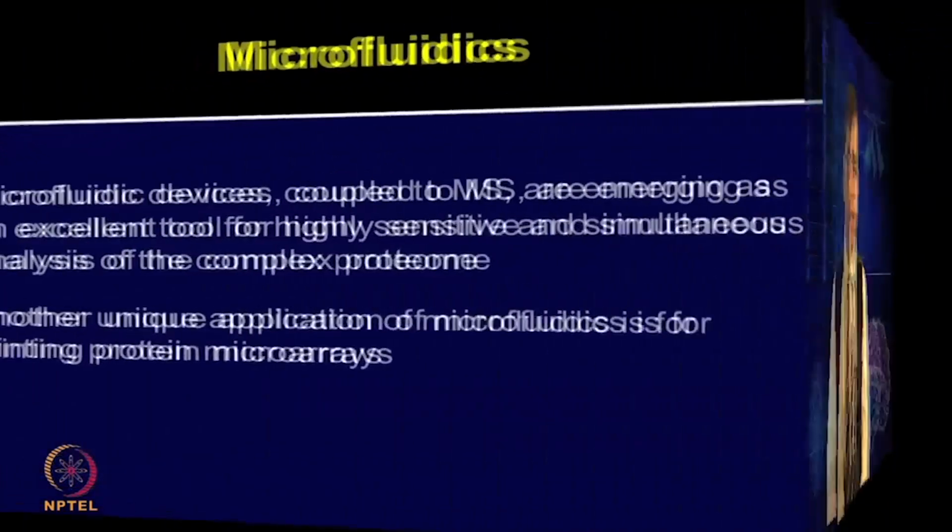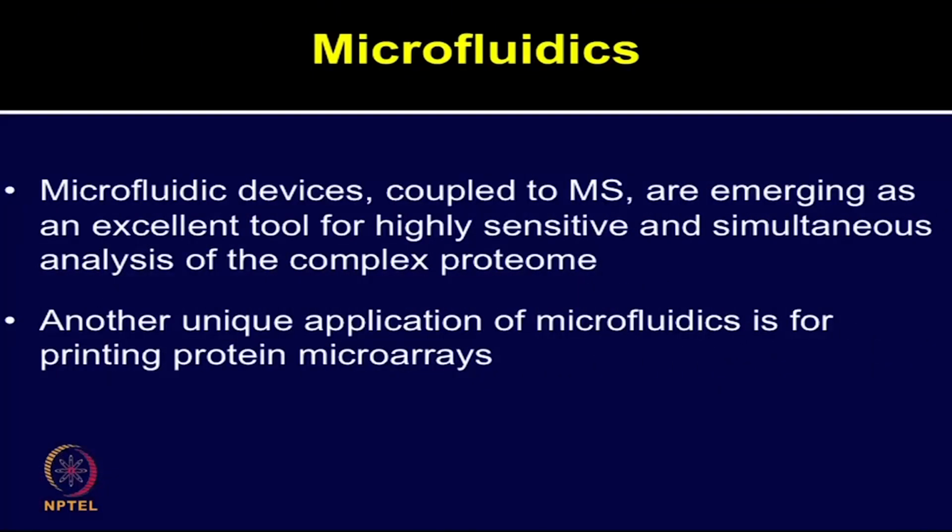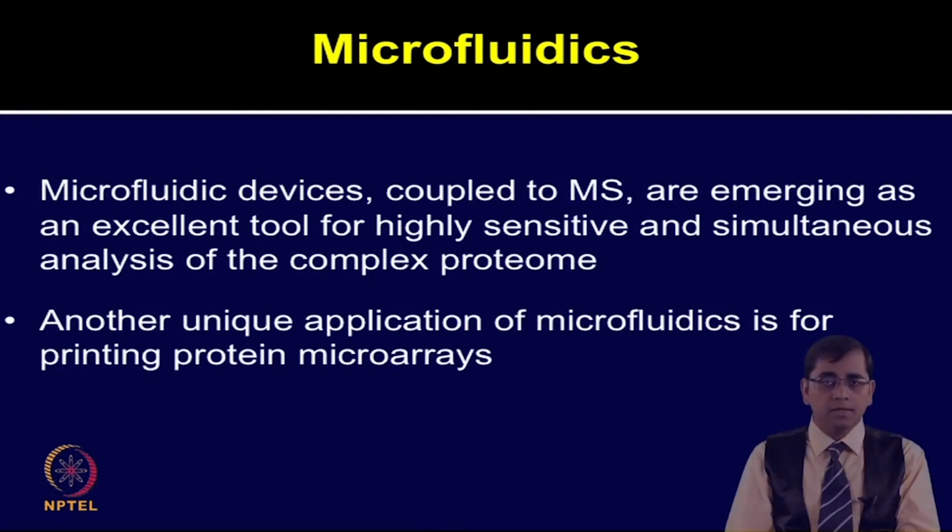Microfluidic devices are now increasingly applied in proteomics and coupled with different types of proteomic technologies. There is intense research and increasing interest in using microfluidic devices and coupling them with mass spectrometry. It can provide an excellent platform for highly sensitive and simultaneous analysis of complex proteome.